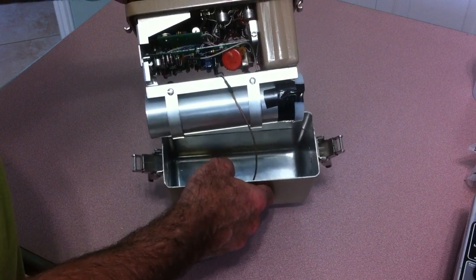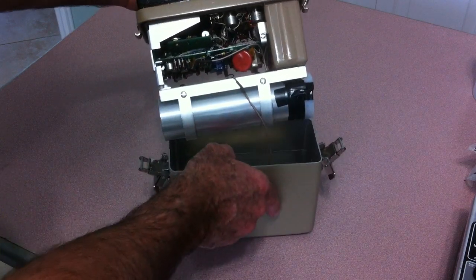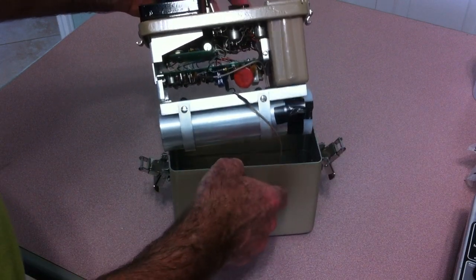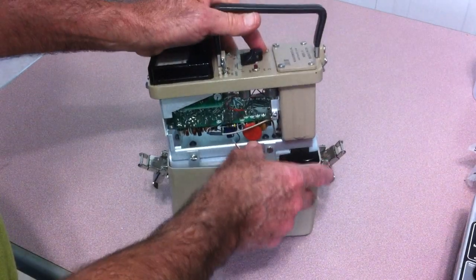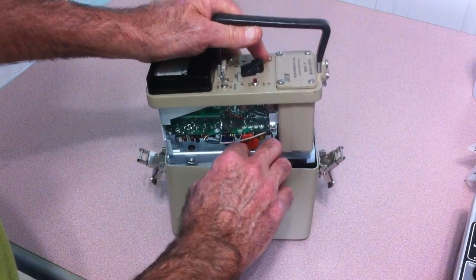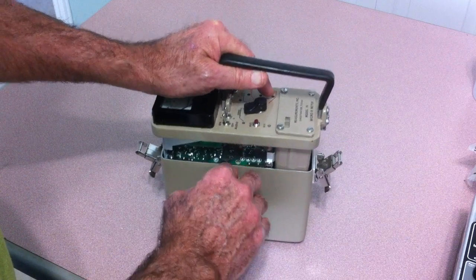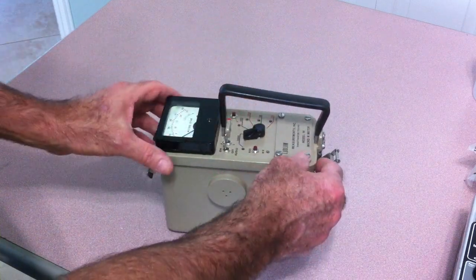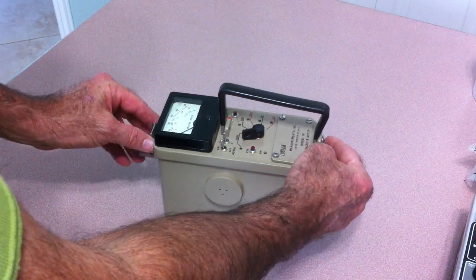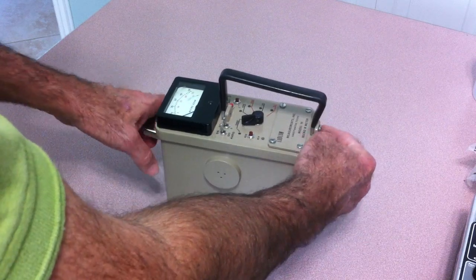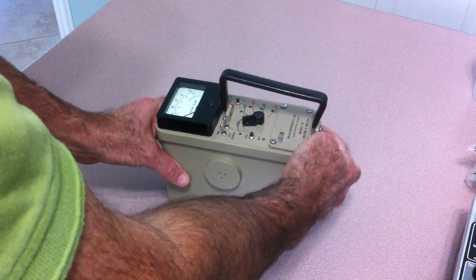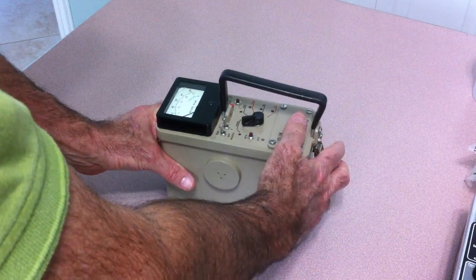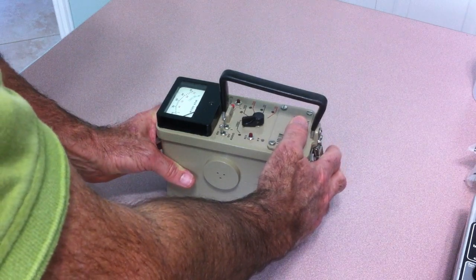So what I did was I replaced the one by one scintillator crystal in this particular unit with a one and a half inch, just slightly larger than one and a half inch by one and a half inch crystal.